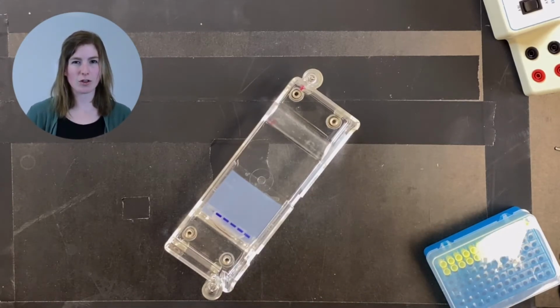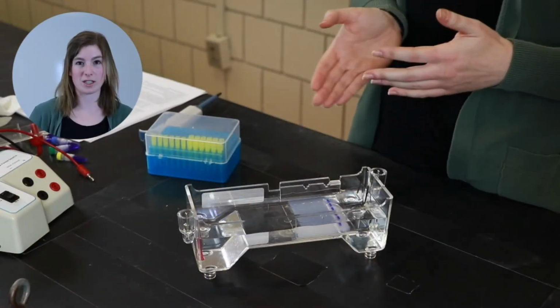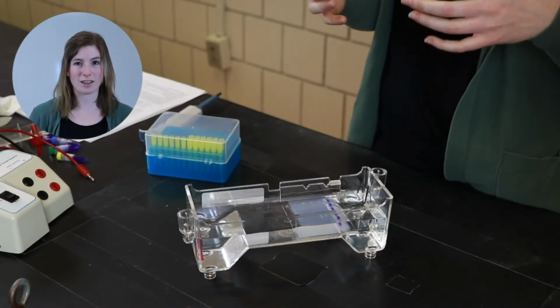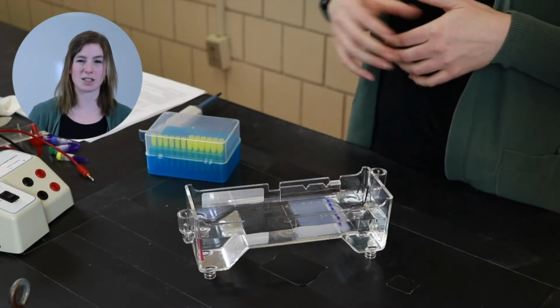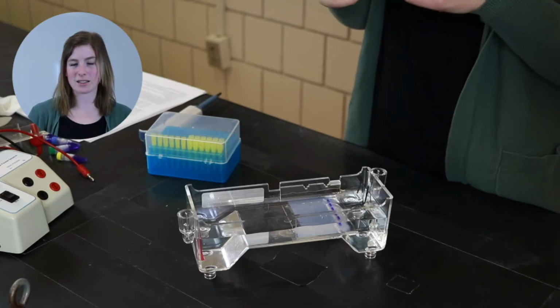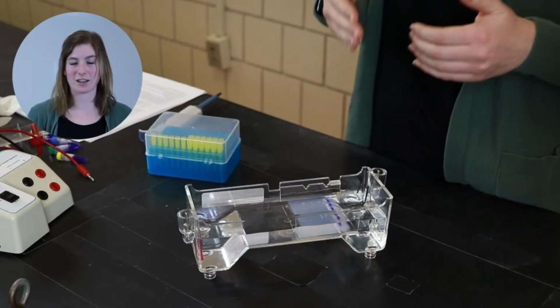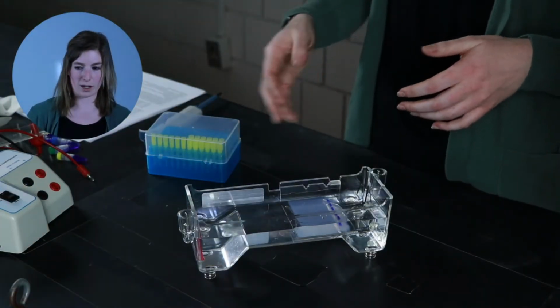And so what we're going to be looking for is a pattern where the suspect DNA looks identical to the crime scene DNA. And that would tell us that those two samples, when cut with these specific restriction enzymes, resulted in DNA pieces that were the same size and ran at the same speeds through my gel box.